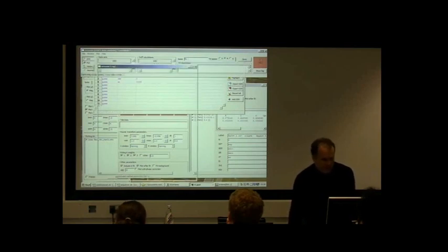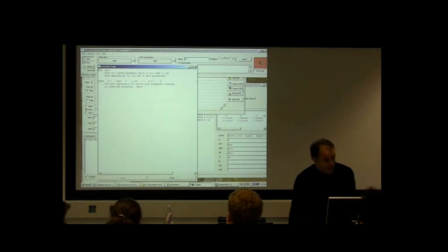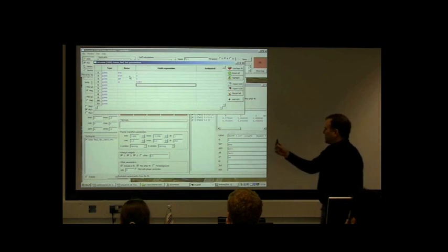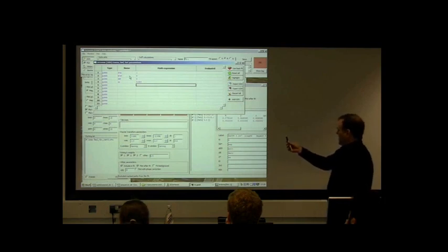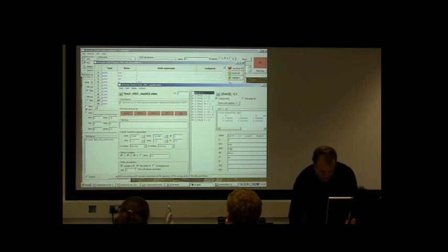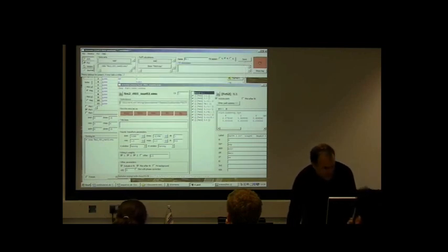Oh, you know what it's telling me? Oh, I see what the problem is. I put in a typo. So Artemis has a spell checker. I spelled it E-N-O-T, and that's actually an M, not an N. So I just typed it wrong, and it was telling me that I typed it wrong. Okay, now I click the fit button and a fit happens.